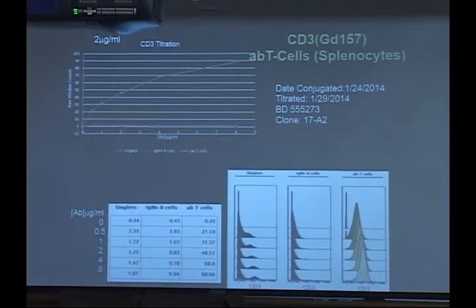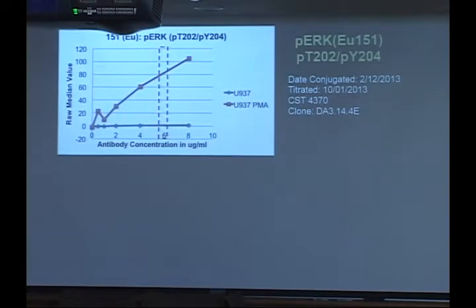And Matt, I'm sure, was going to get into more of that. But this is very, very simple. What it's showing you is that you've got a nice titration of CD3 after you gated out these T cells by some other markers, nothing in the B cells. And you see a little blip in the singlets. And the singlets, of course, are the whole population. And that's quite consistent.